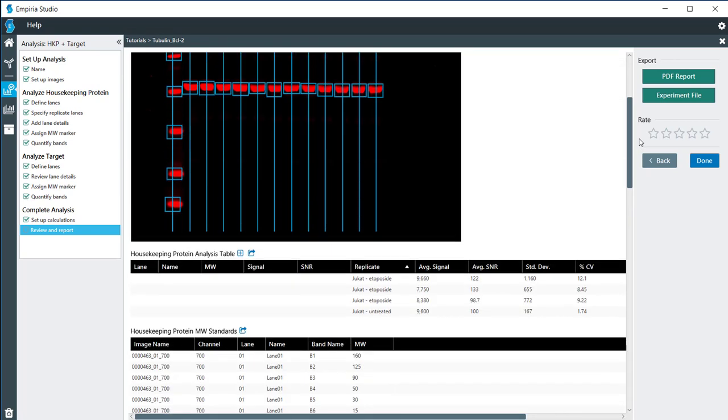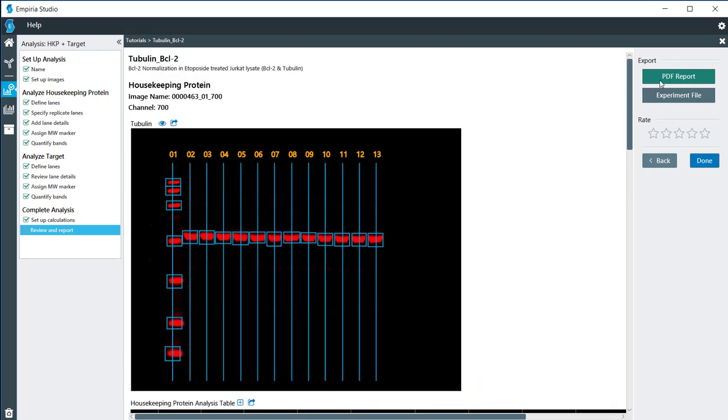If you want to, at this point, you can export this report as a PDF, or you can export it as an experimental file for use on another computer for someone else to look at. You can also rate this, depending on how you thought the experiment went, anywhere from one to five stars. Thank you.